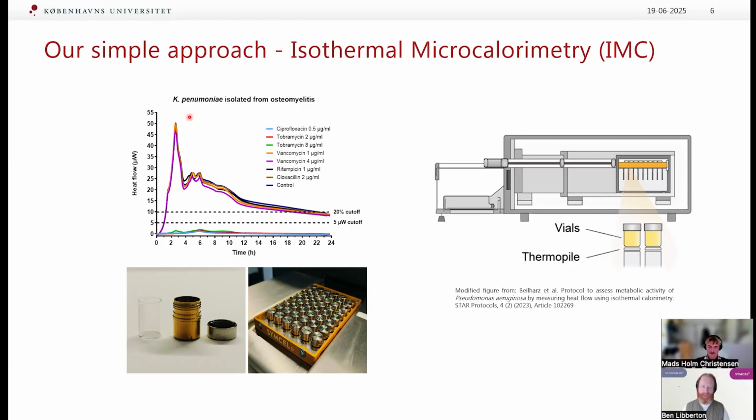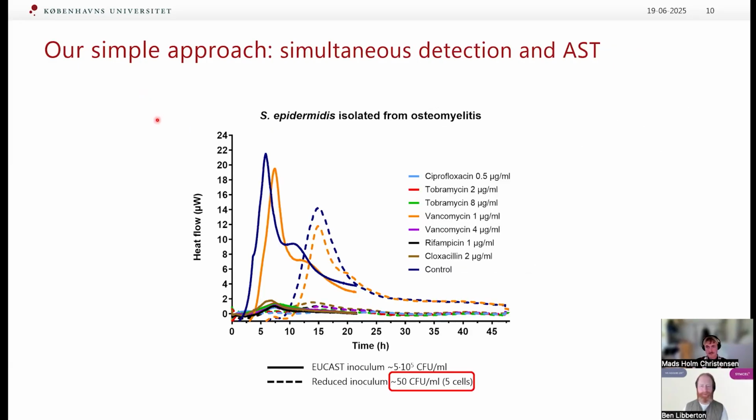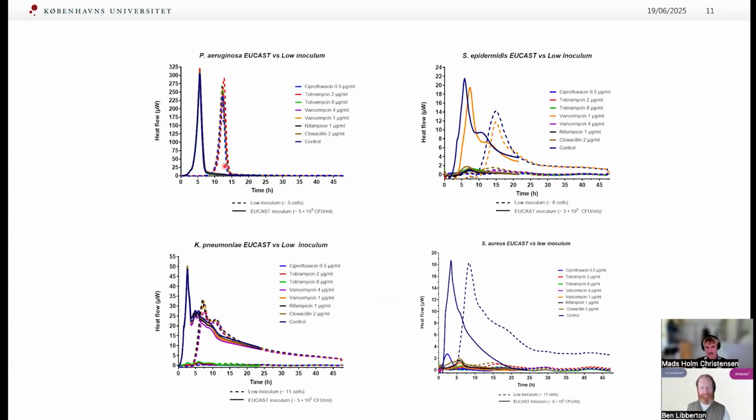Yeah, it's super interesting, the analysis that you're doing. Actually, absolutely right. As you can see, most of them are done with all the essential stuff they're doing within 20 or 15 hours, most of them, even at a low inoculum. So definitely, as long as you streamline the data so you know that you're looking at the area under the curve and it's up until the same time point for all your data.